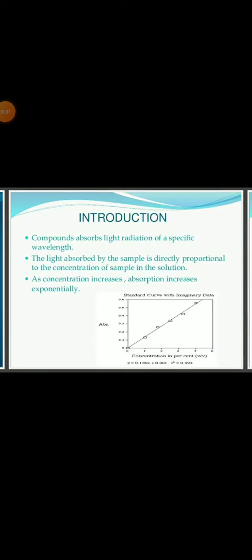Today we will discuss the spectrophotometer. Introduction to the spectrophotometer: compounds absorb light radiation of a specific wavelength. The light absorbed by the sample is directly proportional to the concentration of the sample in the solution.